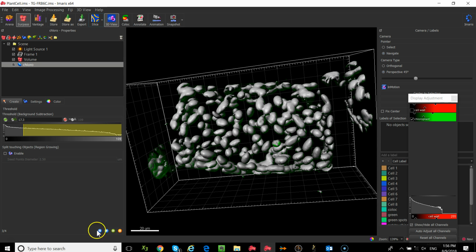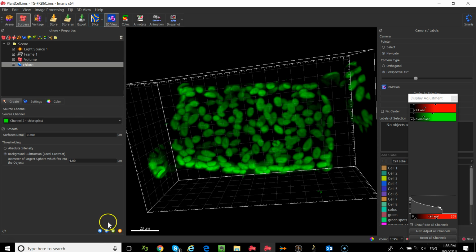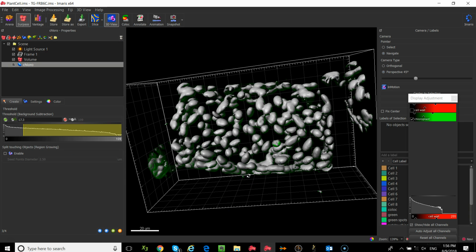Okay? Background subtraction normalizes that for you. So for the majority of people that I work with, I highly recommend background subtraction as the preferred method. Okay.